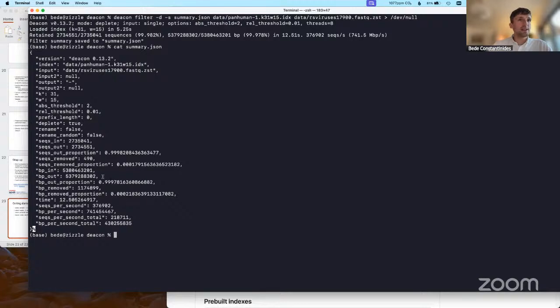You can see that for these viral sequences, 99.98% of them made it through. As we would hope, most of them make it through.